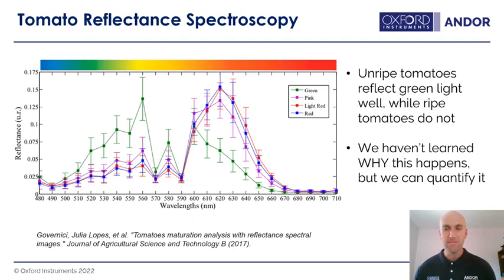But 540, 550 is green, shading to yellow green. And then out here we have a nice deep red, 640 to 660. Although I colored this red, I think that's getting to the point where you can no longer see it very well. At least it's been my experience. And again, your mileage may vary with your eyes.